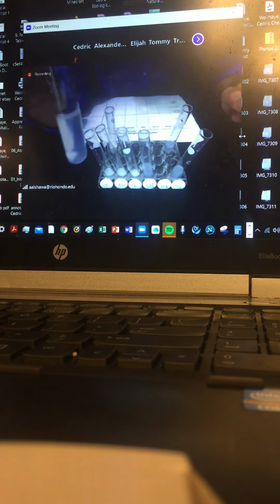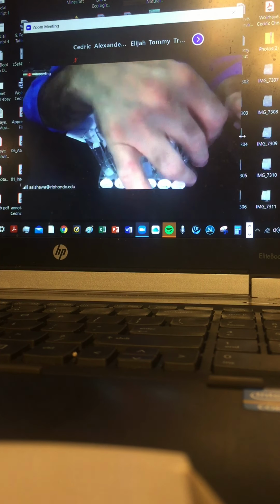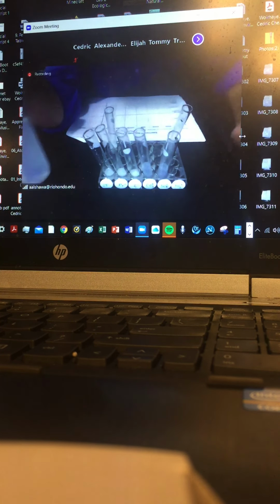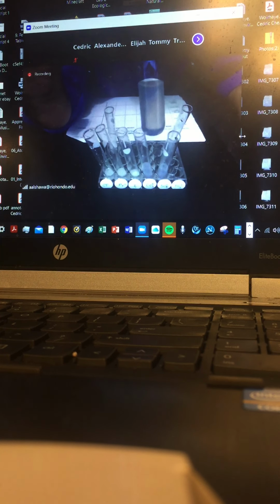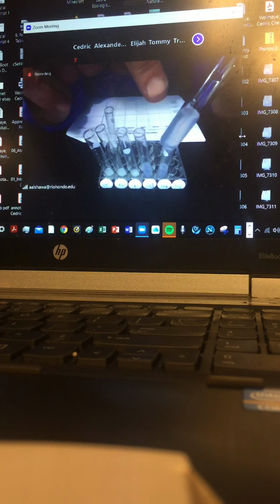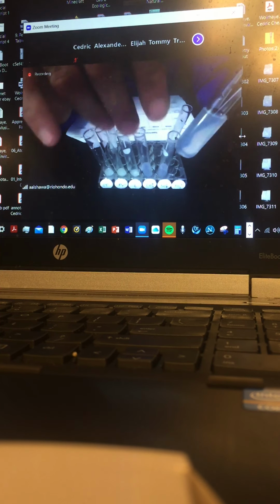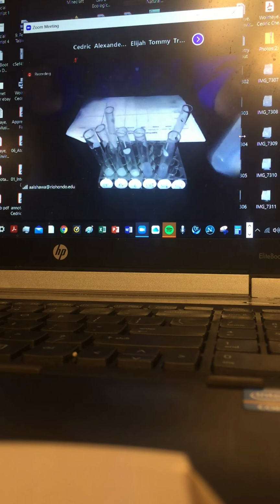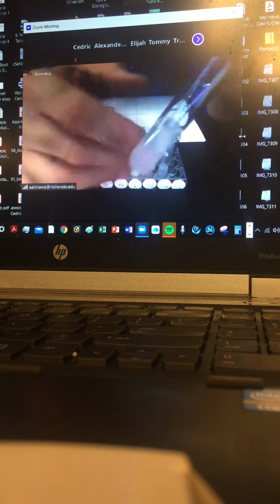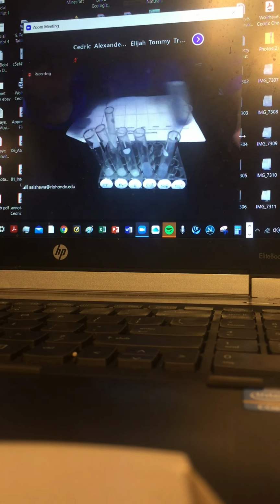Okay, so whatever that sulfate, it's a little bit more clear. The same as all these solids that develop, remember the phosphate, the silver phosphate, that started to structure and develop as yellow crystals. So it's gone. Okay, so that solid is completely dissolved and gone.